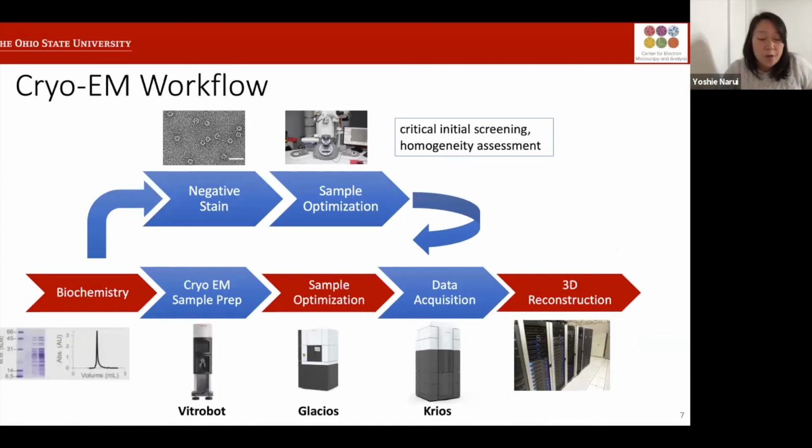Okay, so just to go over the cryo-EM workflow, for those of you that are interested in getting started in cryo-EM but haven't started exploring yet experimentally, I've highlighted in red here the steps that I would say require the most time and effort. The first step is obviously the biochemistry aspect. As a user, you would be responsible for expressing and purifying the protein or particle that you're interested in studying. That can often take many months or years to do.